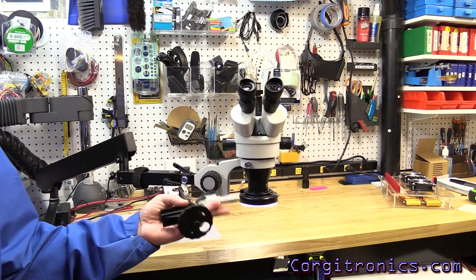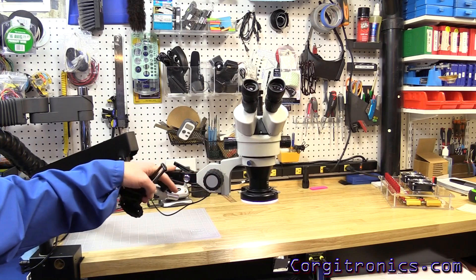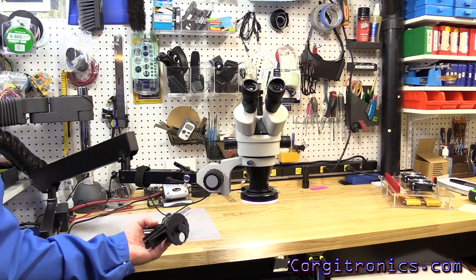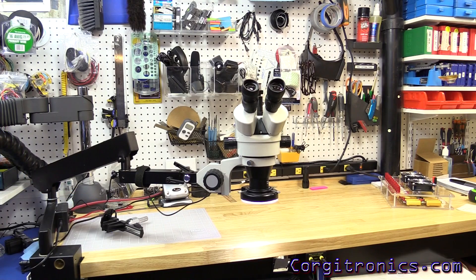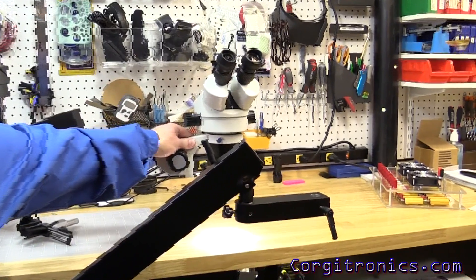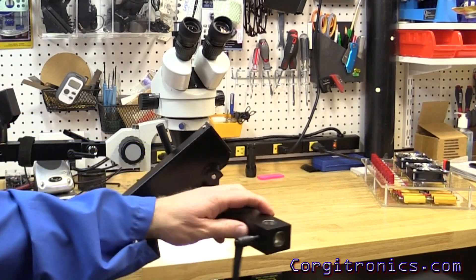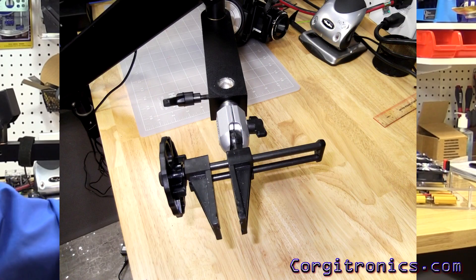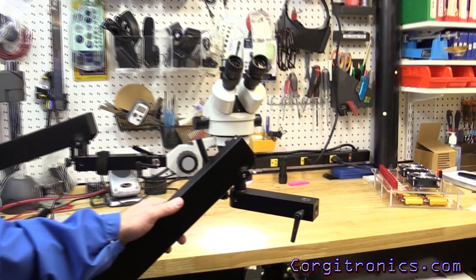That's the same diameter as the mounting pin on a Panavise, so you can take the head off and use this for your Panavise — set it to any angle, any height. It works so great that I bought a second arm. Now I can set the microscope at whatever height and position, and then set my Panavise clamp — I have a couple different models depending on the circuit board or what I'm working on — and just screw it in, clamp it down, and adjust it.